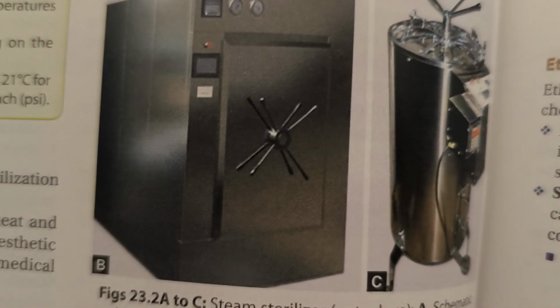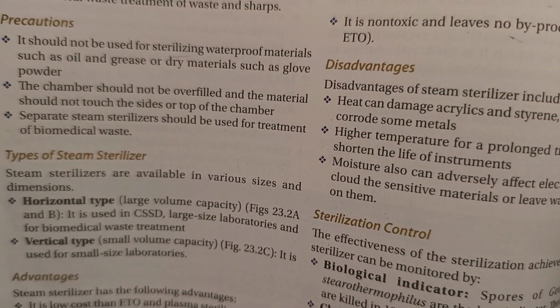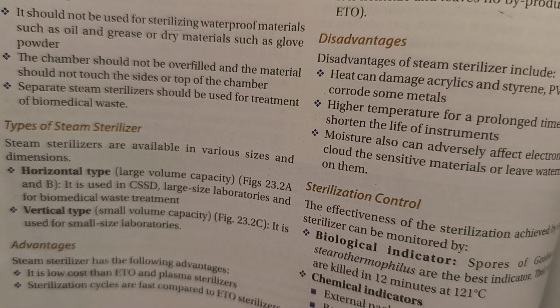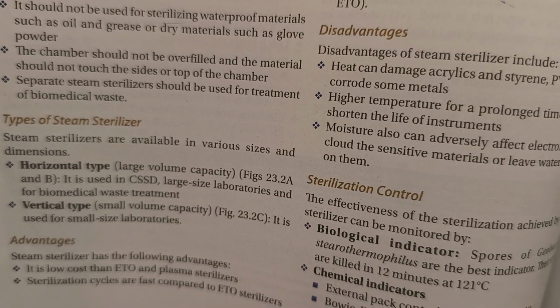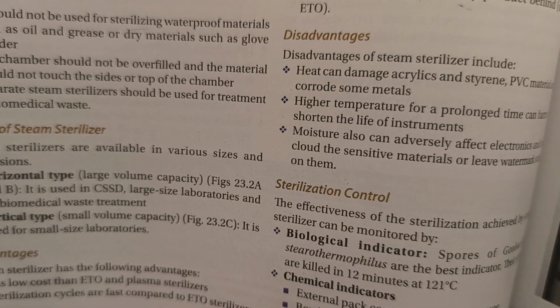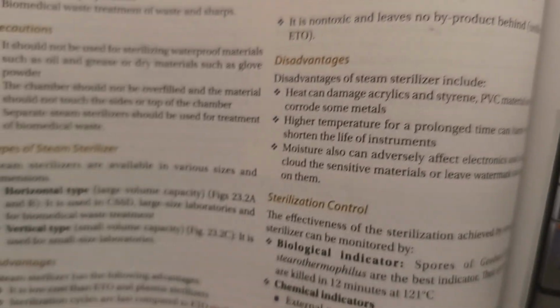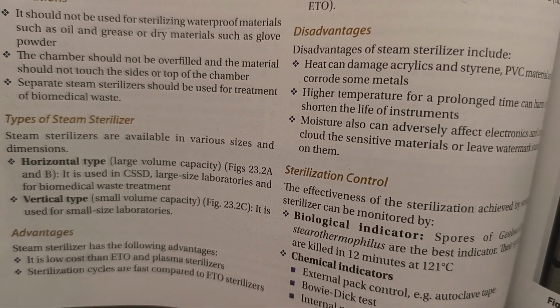So this is the figure of the horizontal sterilizer, figure B. It is used in CSSDs, large size laboratories, and for biomedical waste treatment. Vertical type, small volume capacity, figure 23.2c. This is the vertical type. It is used for small size laboratories.